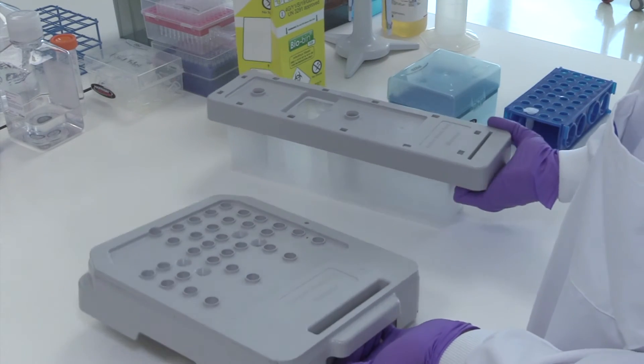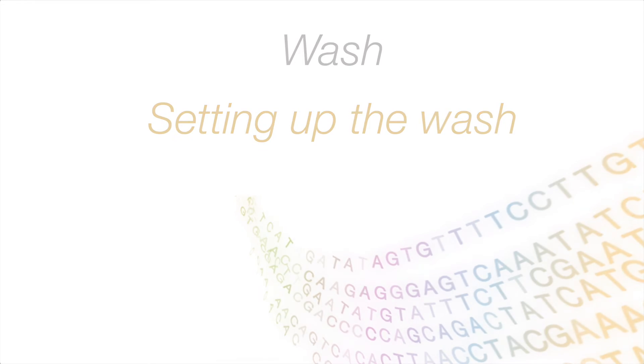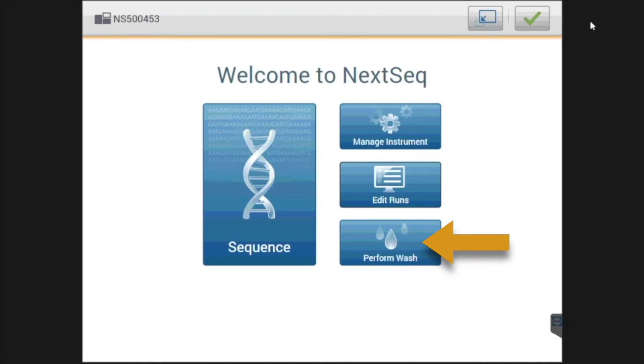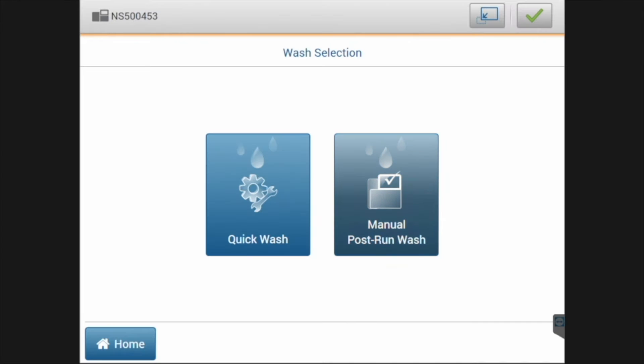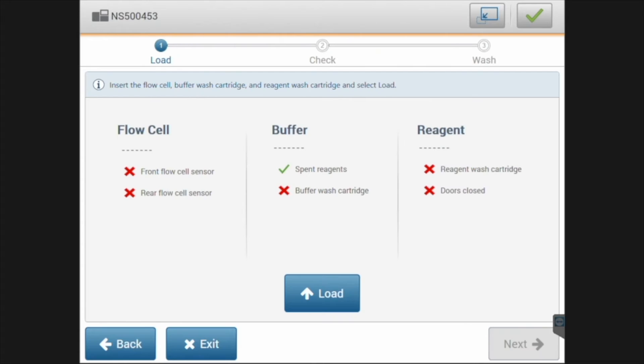Now that the reagents are prepared, let's see how to set up this wash within the NexSeq control software. On the welcome page of the control software, select the perform wash section. Here, select the wash type you want to run. The manual post run wash setup will be shown on screen.